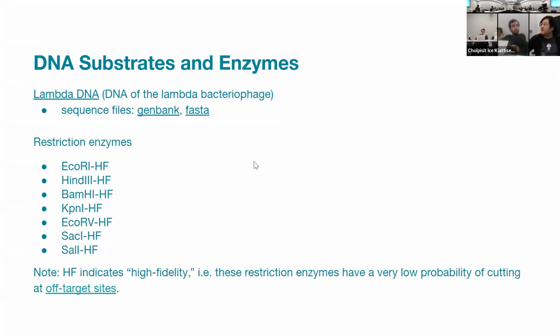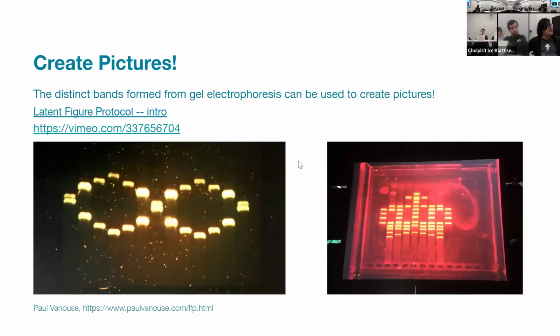And that's where we go, right? One of the questions in the homework is, can you try to digest these with different enzymes? So give it a try. And you can also make this kind of pattern if you have some pre-designed pattern that you can work on. These are the links that you can go into.